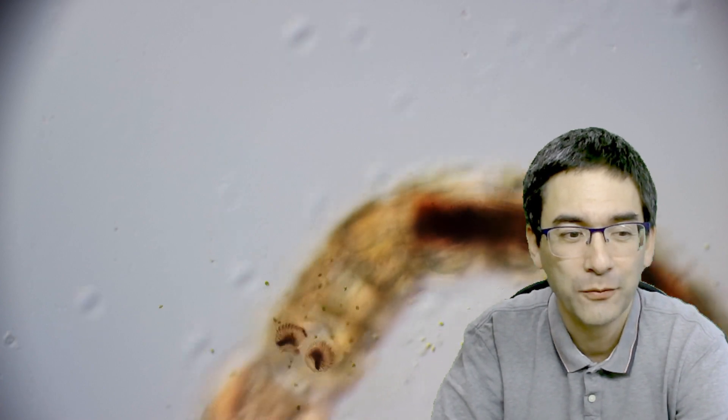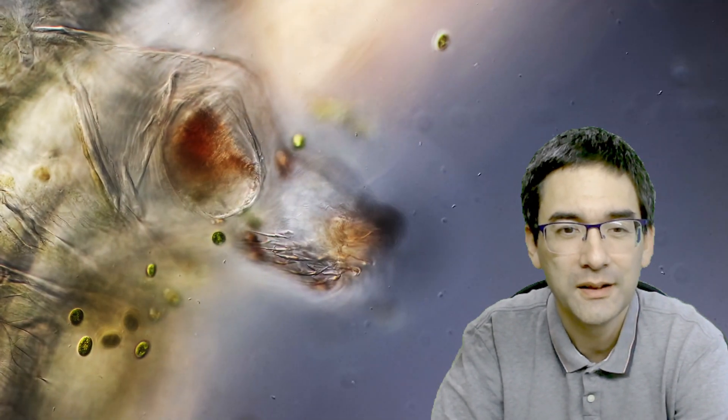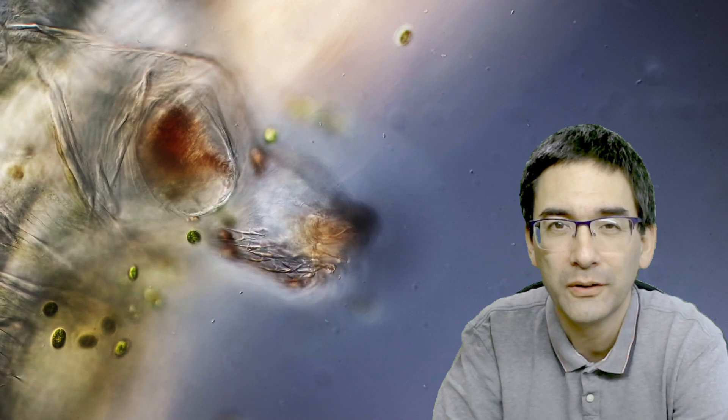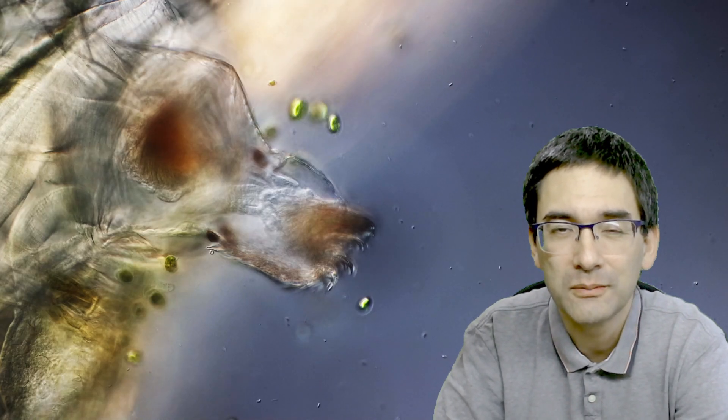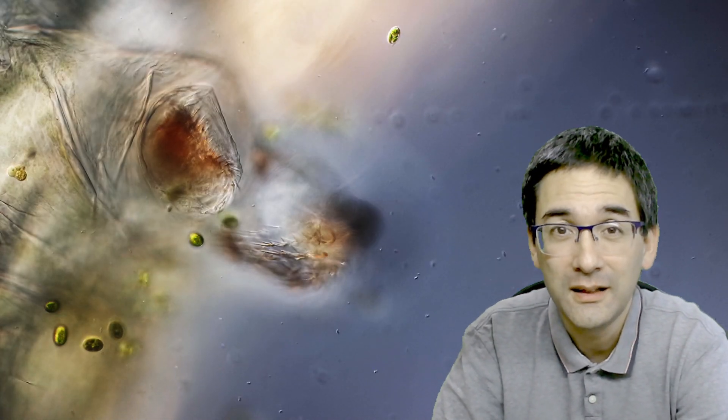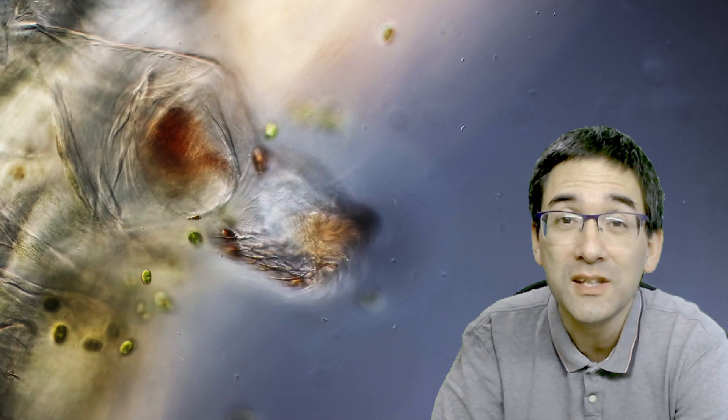But it's quite different here, and I had a closer look. This is where I saw that the feet have a lot of tiny little hairs on them, and I think that this significantly increases the surface area of the feet.